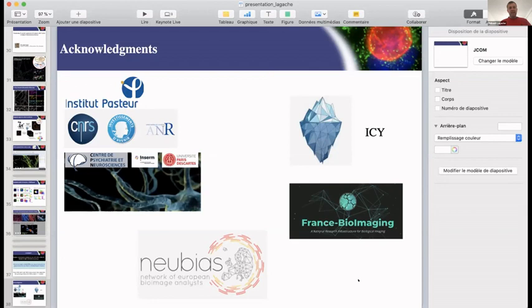But definitely, we are now thinking about how to incorporate the localization error in the computation, and also the resolution, because typically from the resolution, you cannot have two points that are closer than the resolution limit, even in SMLM. So this also complicates the analysis, and we are working on this theoretical aspect.